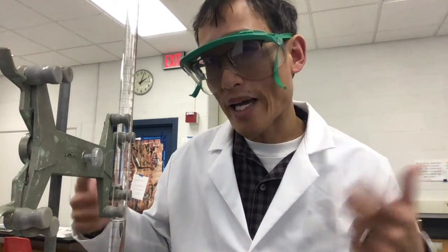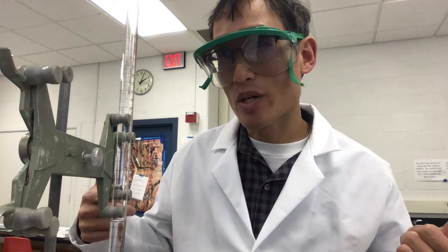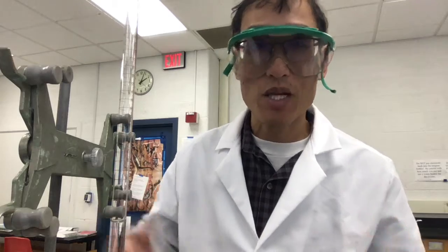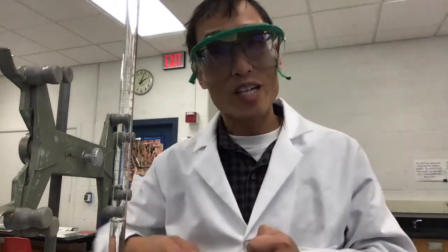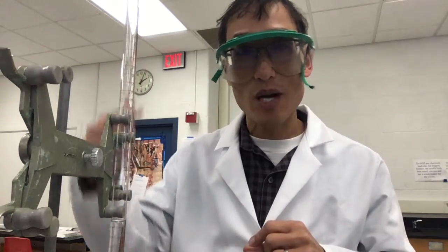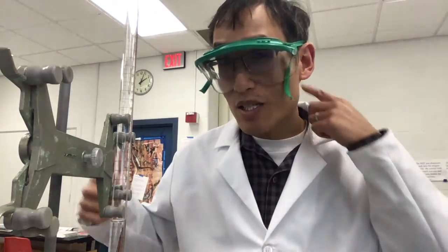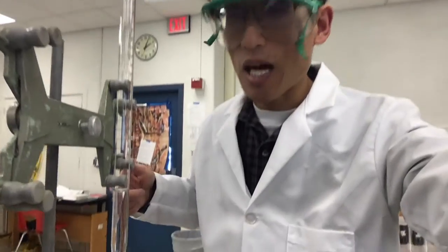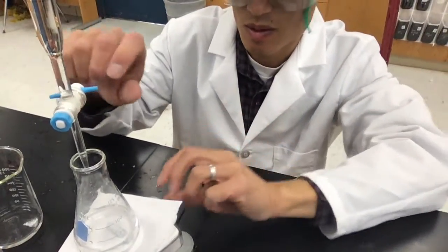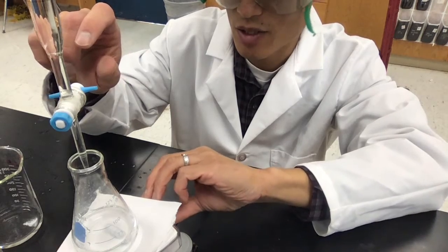And now I can do it again, but I can do it more carefully when I get to about 30 milliliters. Okay? So that's what you do. You do the fast run first, and then you do another run, but once you get to about 30, you do it slower. I'm just going to skip that and go slower right now. Okay, so let me show you. I'm going to turn this on, and I'll show you how to do this.